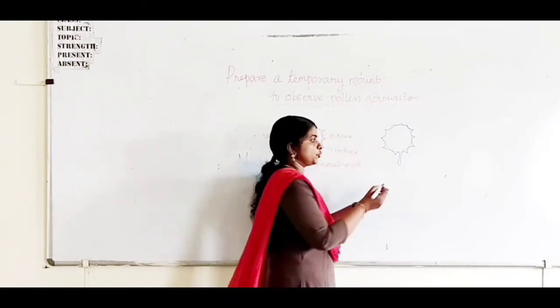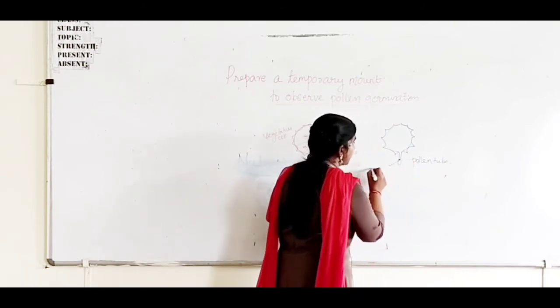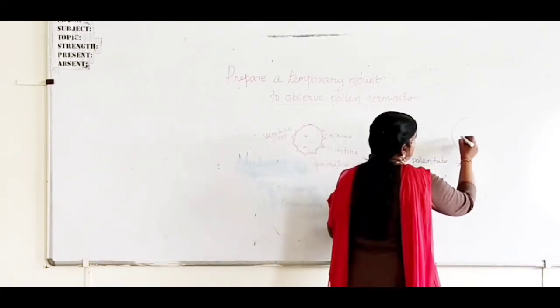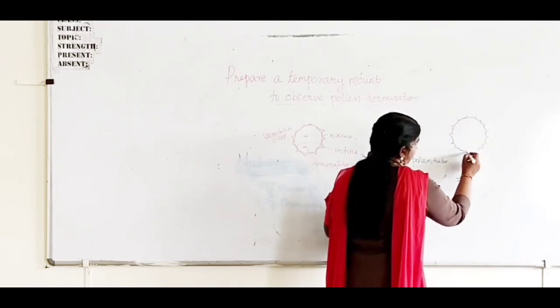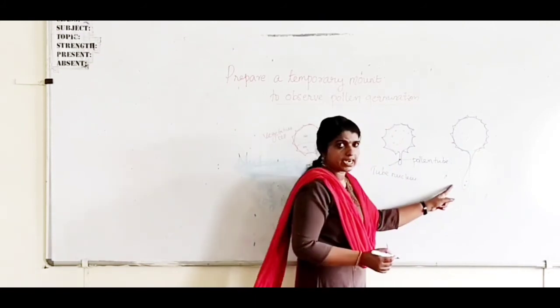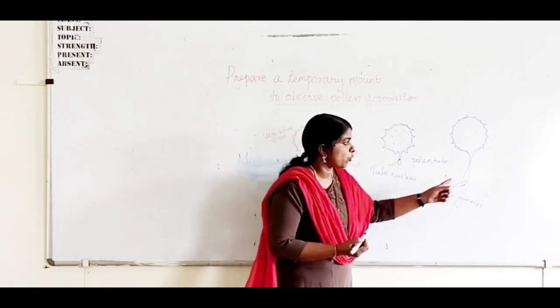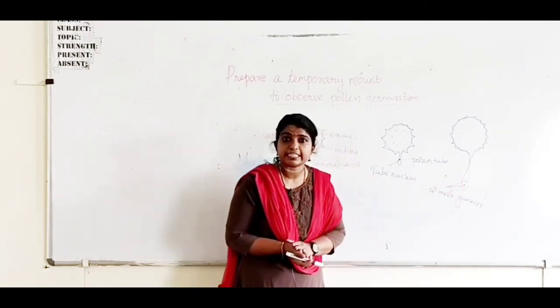First you can see a small tube — this is the pollen tube. A pollen tube nucleus can also be seen. After that, the tube elongates, and at that time the generative cell divides and forms two male gametes. The pollen tube now carries two male gametes in it, formed from the generative cell.